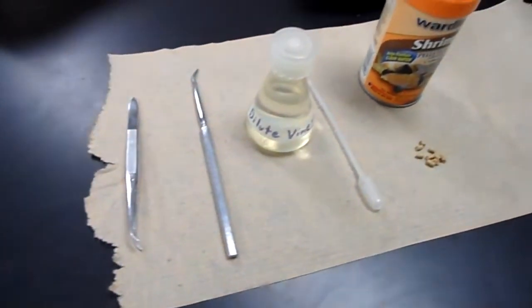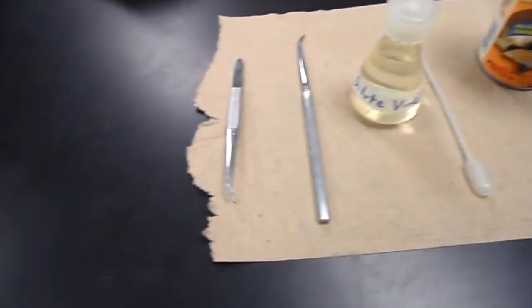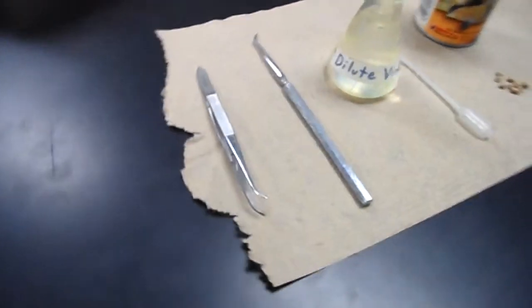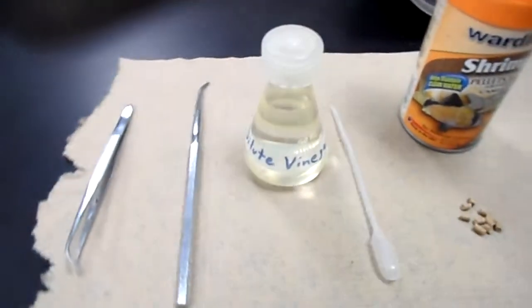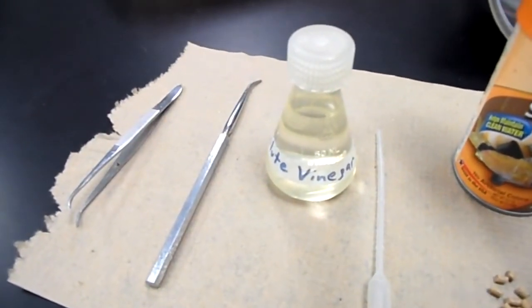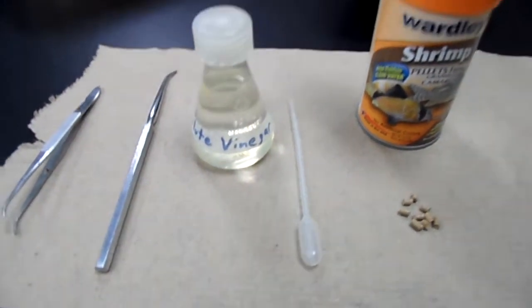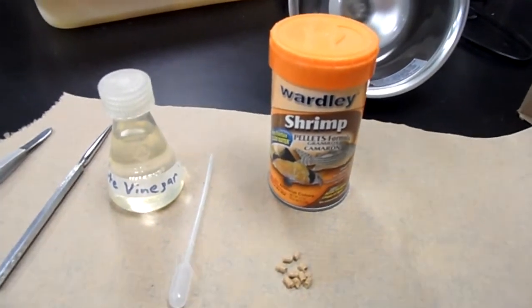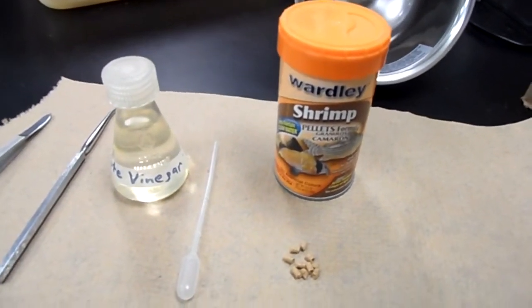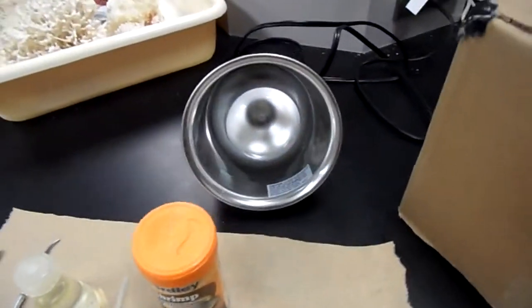So here are the same materials that you'll find on the materials list on the lab handout. We've got a pair of forceps on the left, a blunt metal probe, an Erlenmeyer flask of dilute vinegar, a small pipette, some shrimp pellets. Now on your lab handout it says a bowl of brine shrimp. But I decided to go with the shrimp pellets because they're a lot easier to work with. And then I also added a lamp.